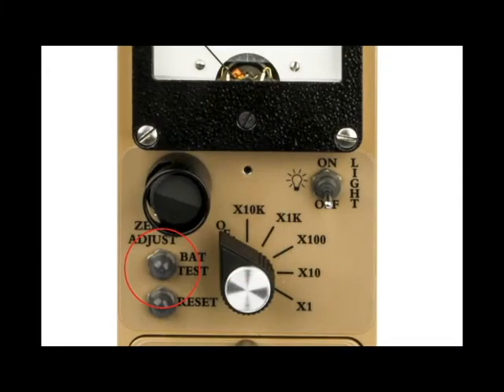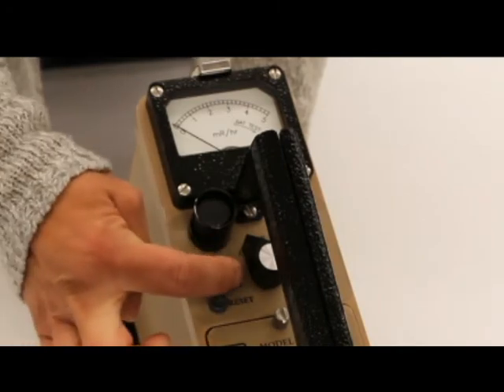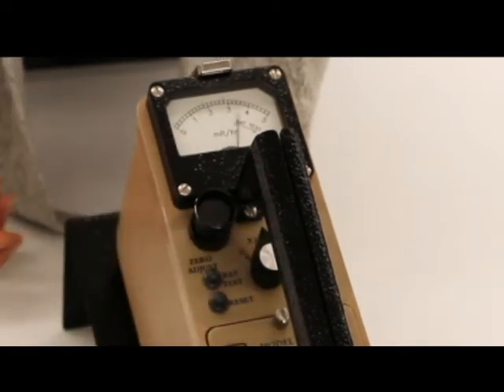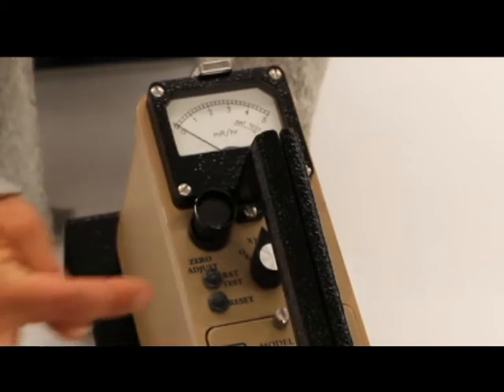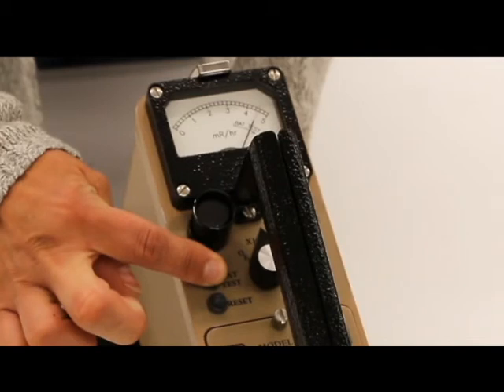The battery should be checked each time the instrument is turned on. Turn the rotary dial to the x10k position. The meter will do a 5-second countdown, then will go to zero. Press the BAT test button and ensure the needle goes into the black arrow portion on the meter dial. If it reads less than that, replace the batteries with fresh ones.